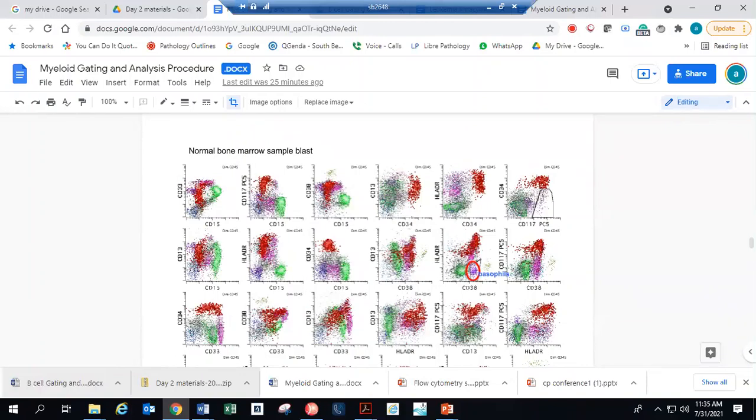If it is sitting very bright and there is only one population that is very bright, then you have to start thinking that it is abnormal. So you can see over here as well, the CD13 is having a variable expression. HLA-DR also has a variable expression. Everything that we learned yesterday must have evaporated in most of your minds, unless you did a thorough reading again. But again, the spectrum of HLA-DR would be similar, like the blast will have a spectrum, right?